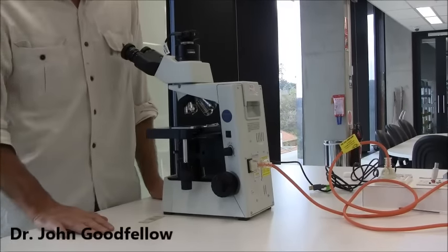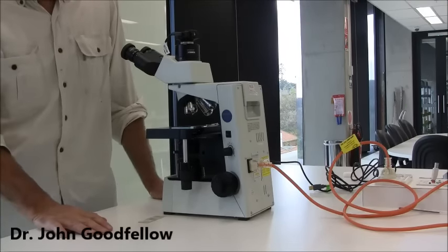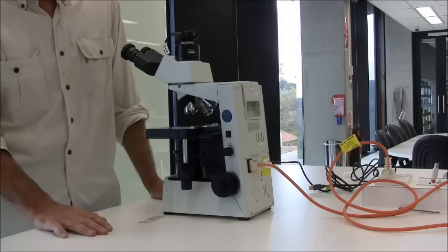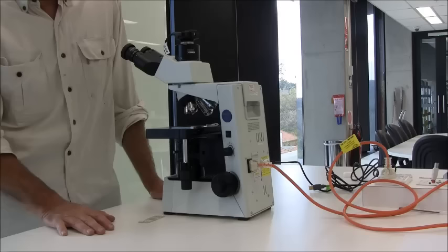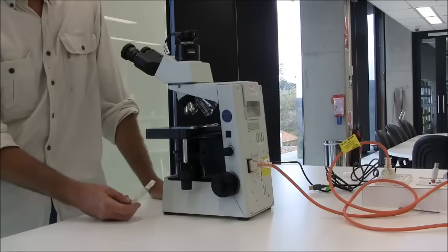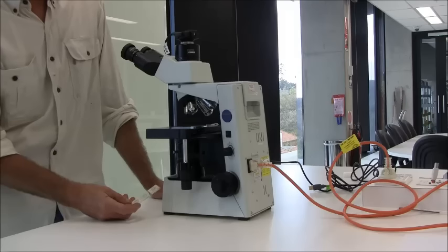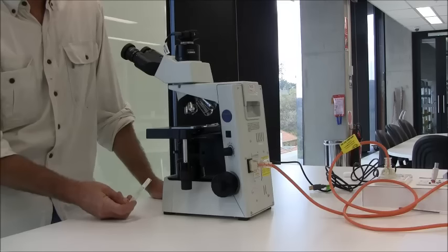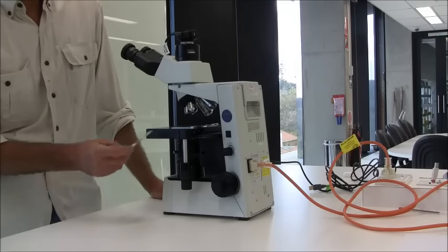The compound microscope is a little bit more complex than the dissecting microscope. It has a few more dials and it needs a little more careful treatment. It's used for looking at specimens that are generally microscopic to the naked eye and specimens that are very, very thin so that light can pass through them.